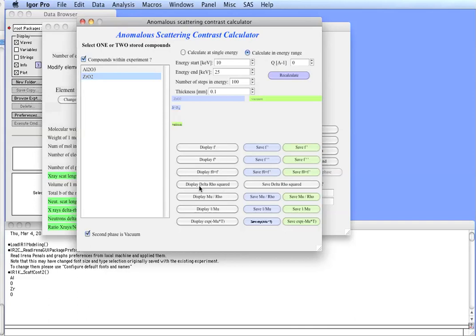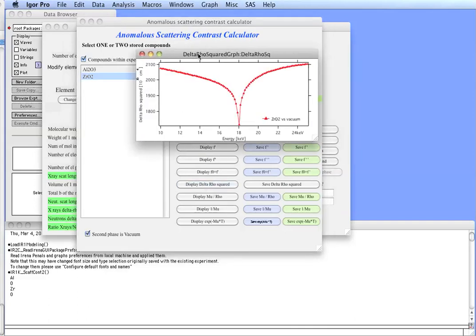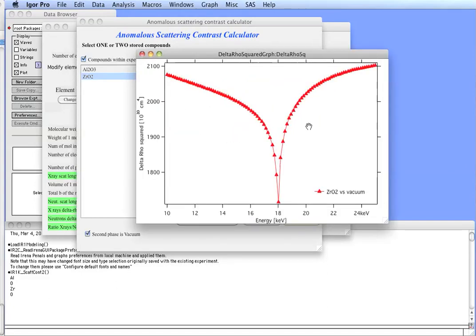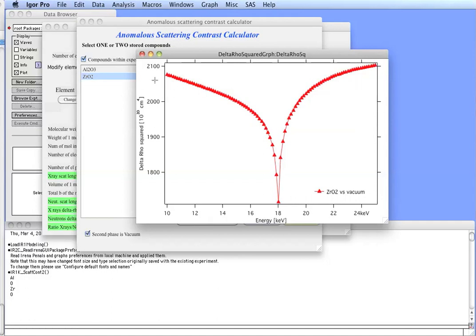So, if we, for example, come here and say display delta rho squared, we will get a delta rho squared zirconium oxide versus vacuum. And you can see that at about 10, we start just below 2100, but it drops down to nearly 1700 at exactly edge, and then comes back up, and it's 2100 at about 25. So, you can see that if you are doing an anomalous experiment, you can use this tool to actually pick the energies at which you are supposed to do the experiments at appropriate energies.